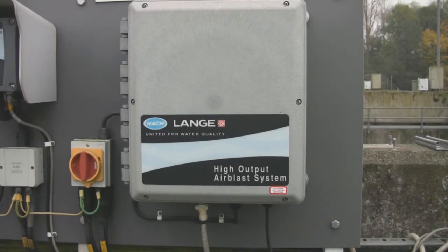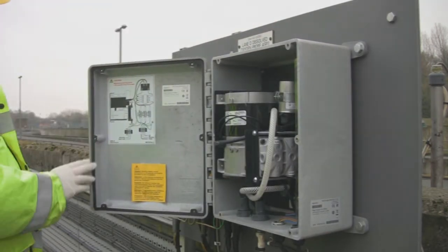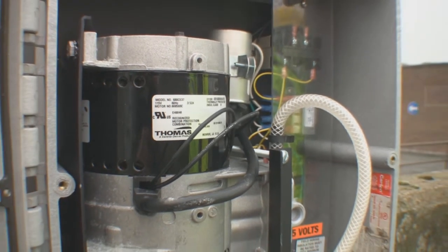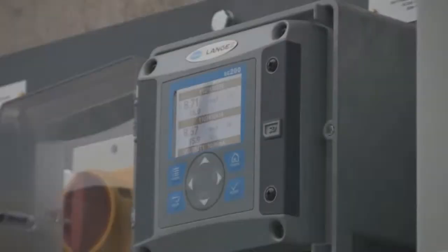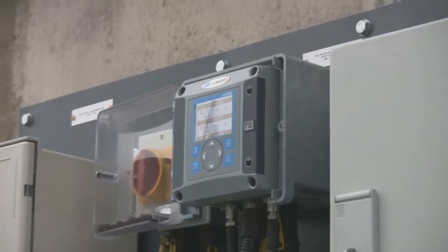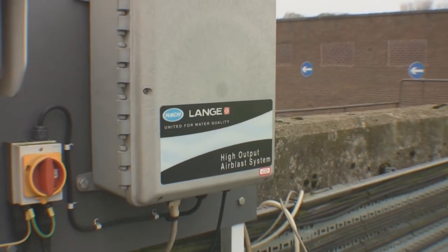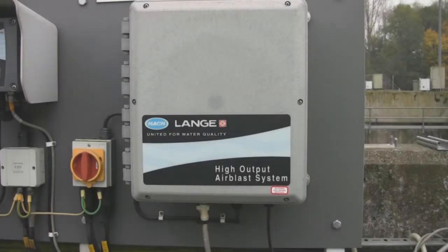Hacklanger offers an optional airblast cleaning system for your LDO probe. It consists of a compressor with cleaning head, 7.6 metres of delivery hose and associated tie wraps. The interval and duration of cleaning are set from the SC controller, as well as the ability of the system to hold outputs after each cleaning cycle is finished. This allows the air to dissipate and avoids erratic readings or spikes from the probe.